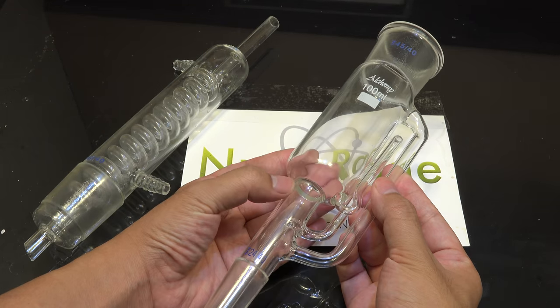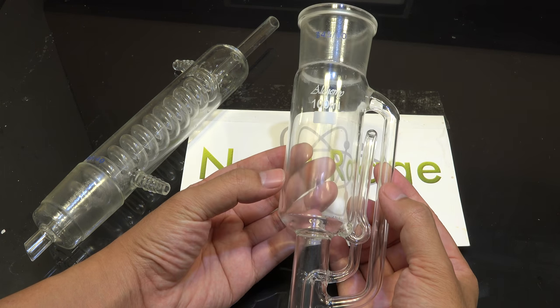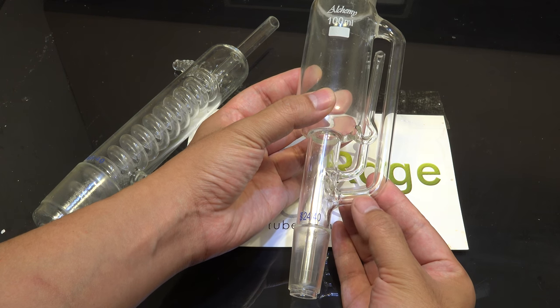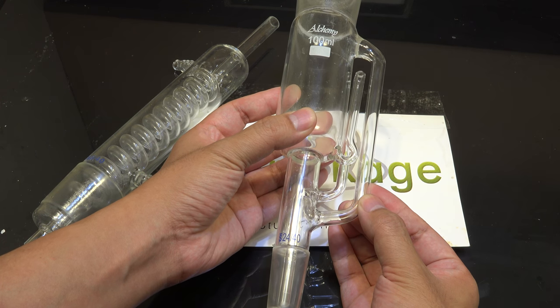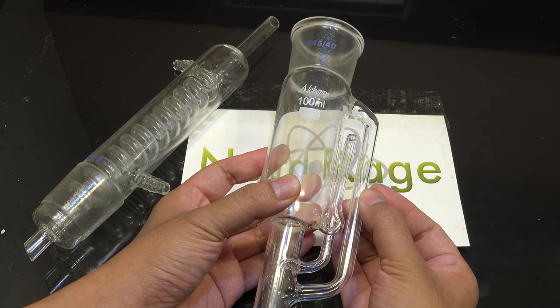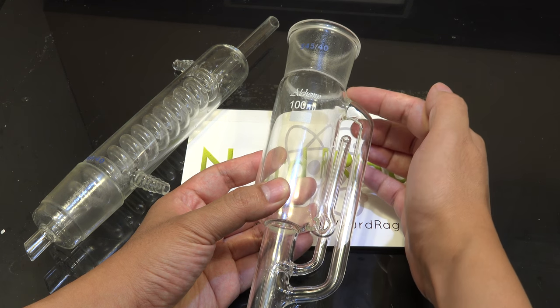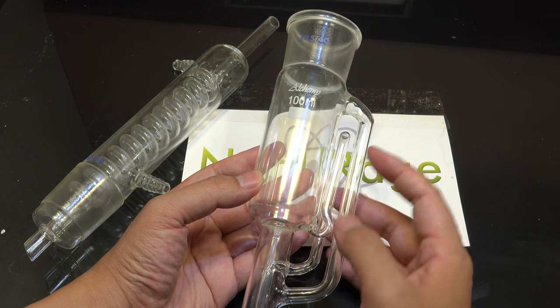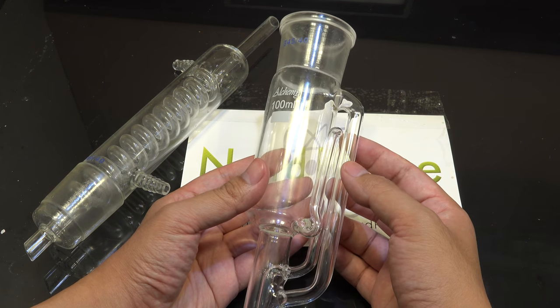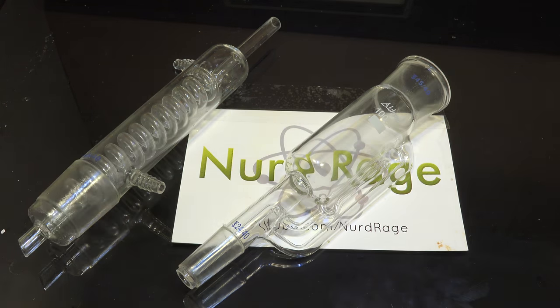Now the extractor looks like the large main body is open right through, but it's actually closed with glass. It's just connected for structural support. The vapors and liquids can only travel through these two side tubes. This outer tube is where the vapors from your boiling flask travel. They rise up and into the main body where they condense on the condenser and fall into the trap. Because it's closed, the solvent accumulates and dissolves the chemicals. Eventually the trap overflows and activates the siphon tube, which quickly siphons out the solution and dumps it into the boiling flask. Of course, talking about it is one thing, let me actually show you.